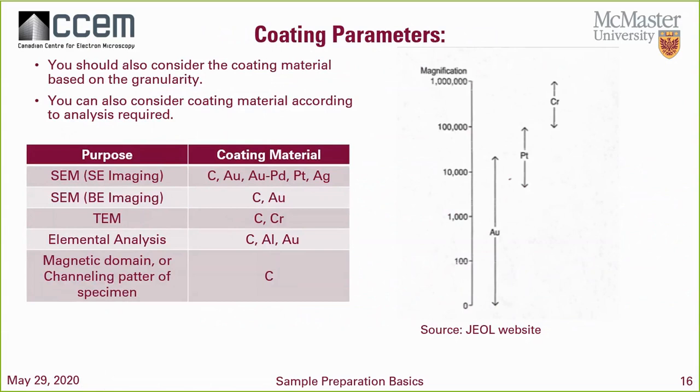So last question, more on coatings. Metal coatings are often used in SEM sample preparation. How do we make sure that the sample metal interface isn't changing when using these metals, and does it affect spectroscopy in the SEM, like EDX?